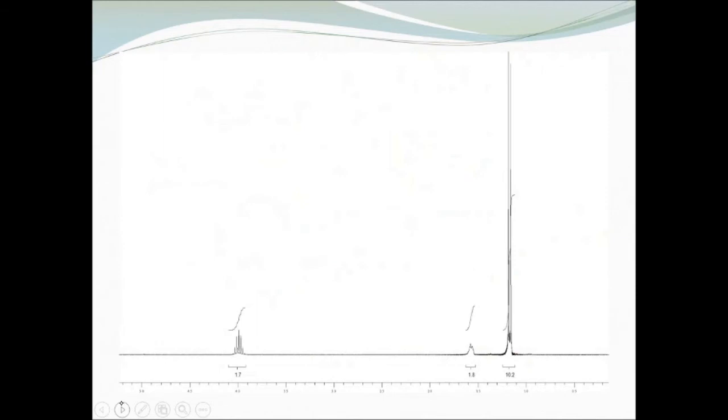So this is an example similar to what you will be seeing for the spectra for your product. Again, notice that underneath, we have our integrations. Don't confuse these with the chemical shift. These are integrations. This is the chemical shift, which is represented by the Greek symbol delta, and the units are ppm. But it is a scale underneath, the continuous one, that shows chemical shift, and it's the little bracketed items that give the integration.